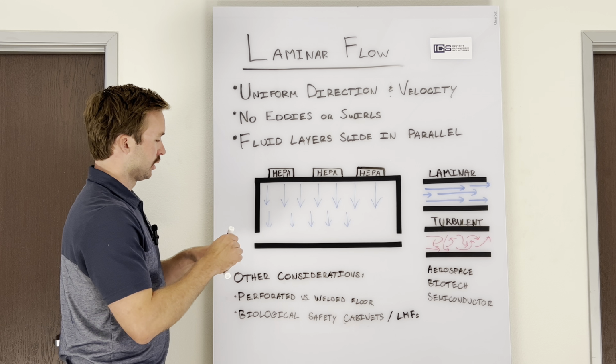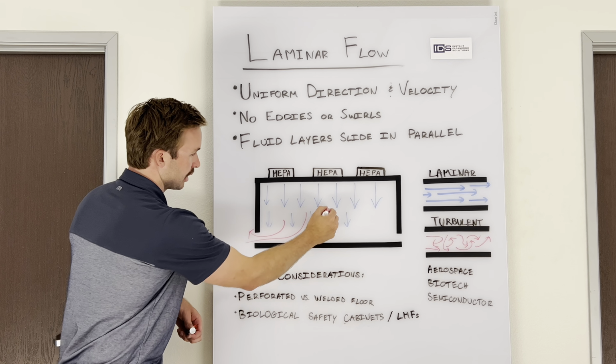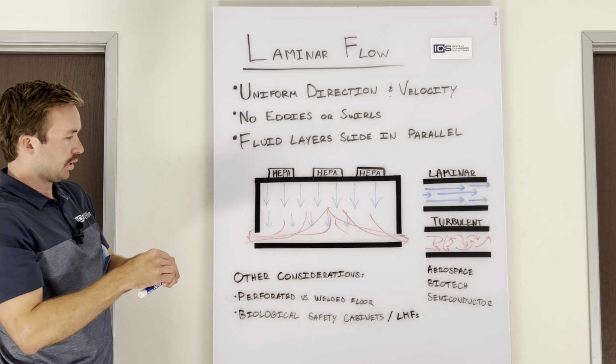low wall returns. And so this is going to start moving air out like this, and as it gets closer, it's going to start pulling more, and it's going to be exhausting just like that, okay? And so this gets rid of your laminar flow. This air is eventually going to return up to these HEPA filters, and this is a simplified version. Eventually you're going to have some cool air or HVAC added in. This is just a general description of a non-laminar flow.